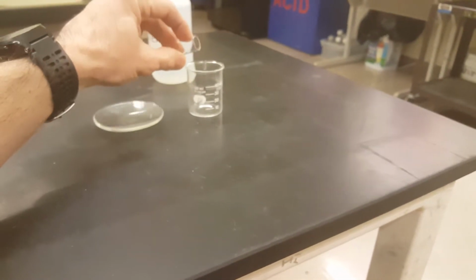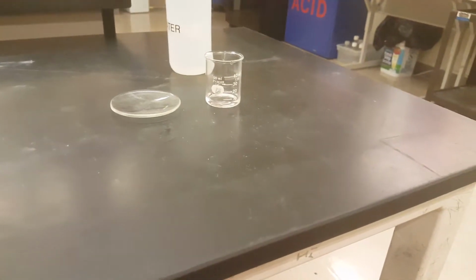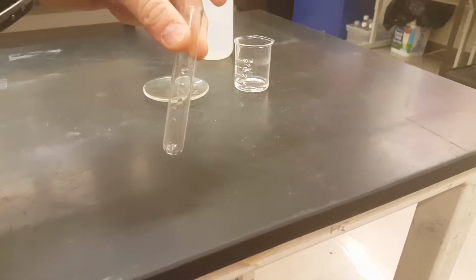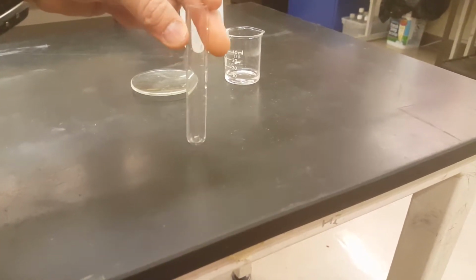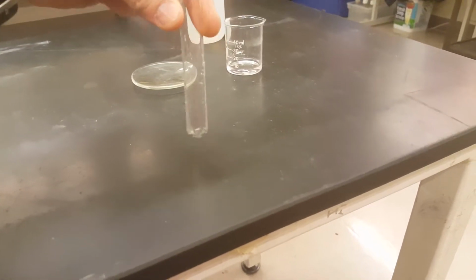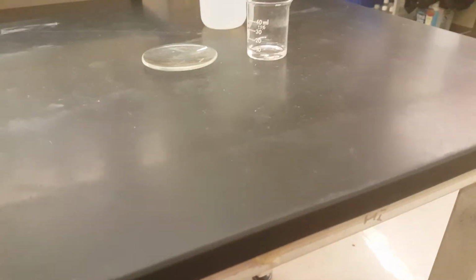All the liquids that we're working with today are volatile, but if you feel like there's some sort of sticky residue in here, then go ahead and wash this out in the sink, and then take some paper towel and tease the paper towel into like a paper towel rod, and stick that down in here into the test tube and dry it out. All right.